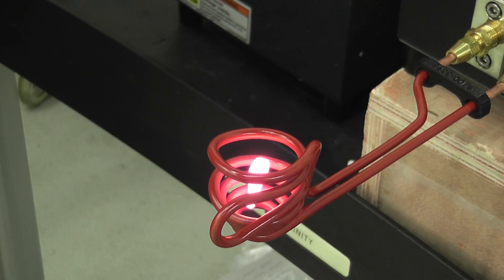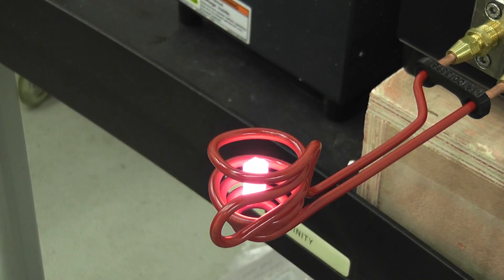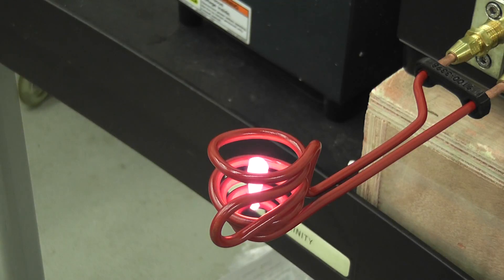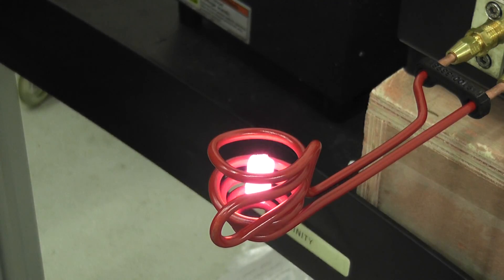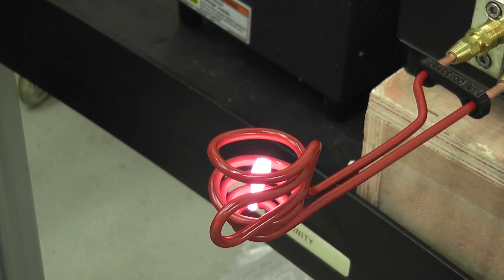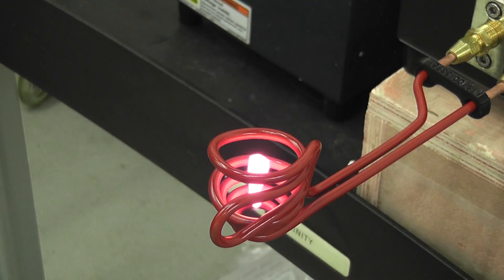So this is what they use for material testing. Basically, material development. They develop in a lot. So what's the concept here? Based on the frequency you're using and specific mass... Different materials would have specific weight and specific heating. Depending on the different materials, we've got different densities, but what is this material?